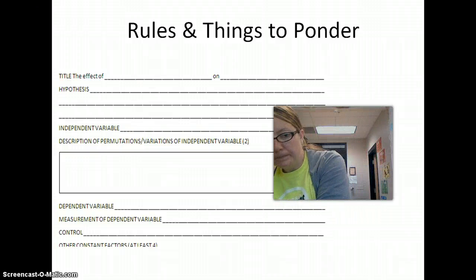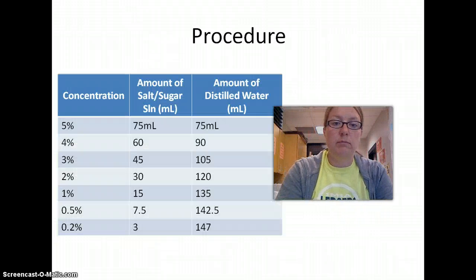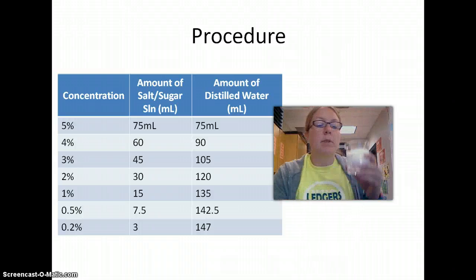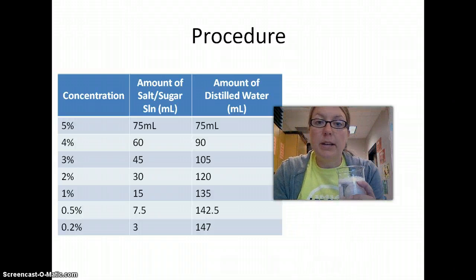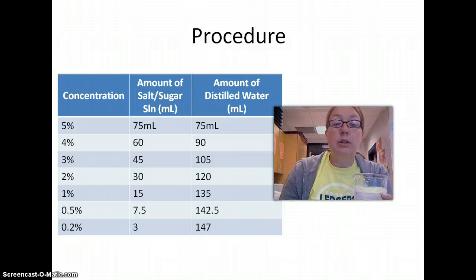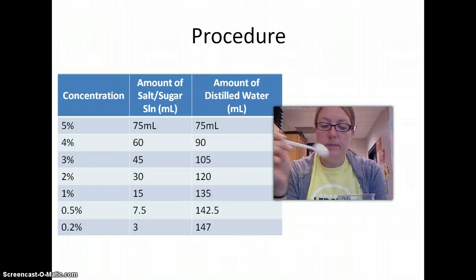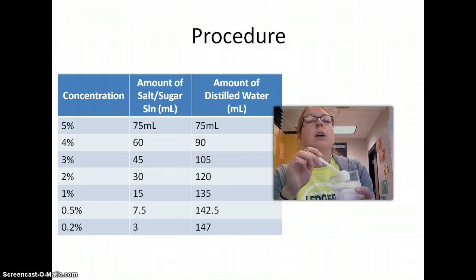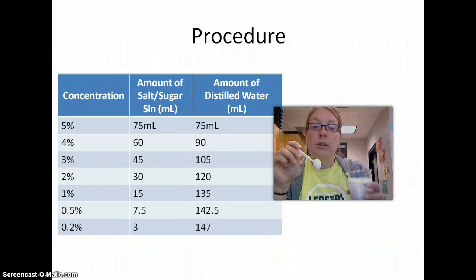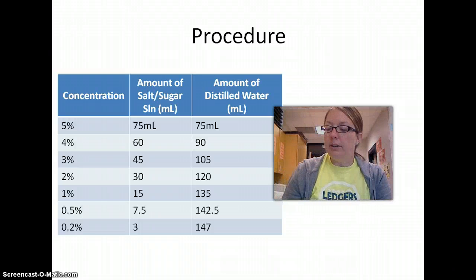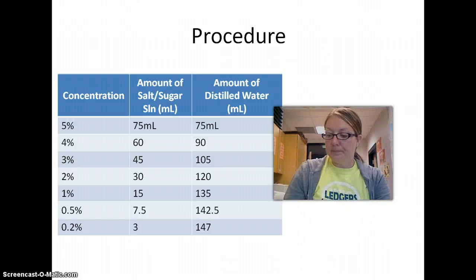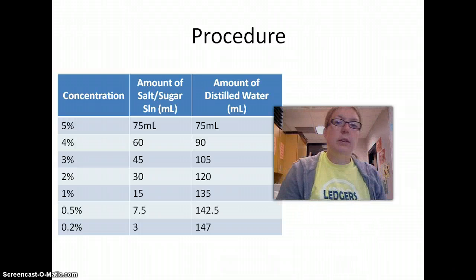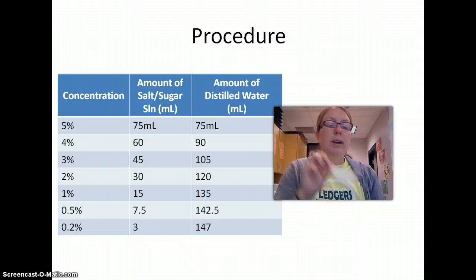So let me put these aside and I'm actually going to set up the control. For the control — and it's going to be for everybody — we're going to take my egg right here and make the control for every single group. What you're going to do is take a spoon from the bunch that we have, drain out the acid into the sink. Then be really careful and rinse that egg and the beaker with tap water, and empty it all out so all you have sitting in here is an egg. Then you'll want to carefully take the egg out and pat it dry.